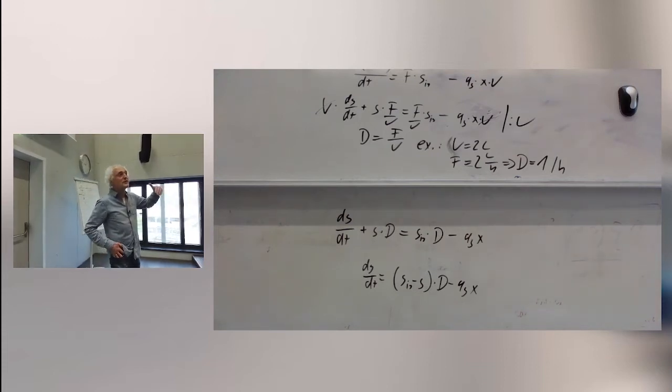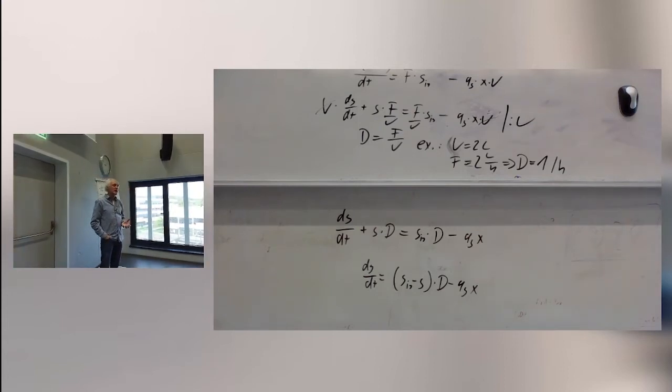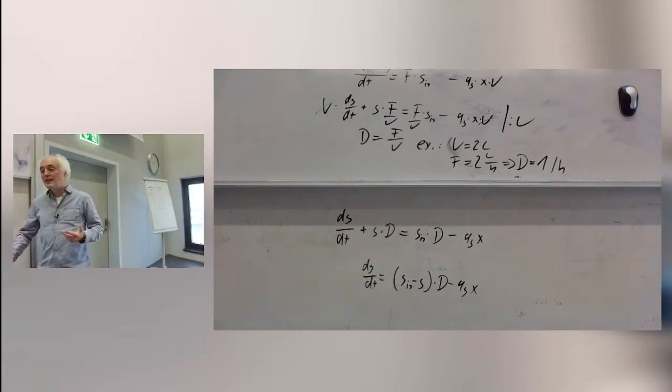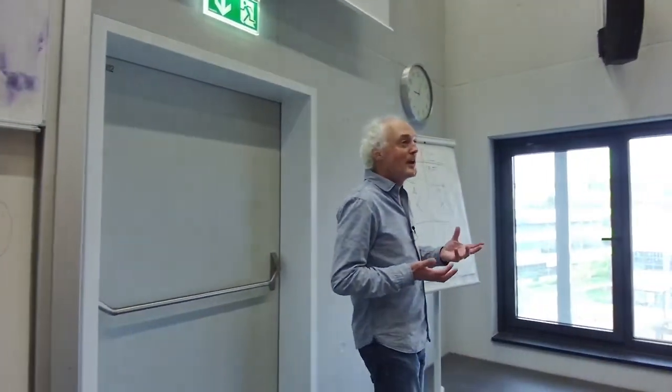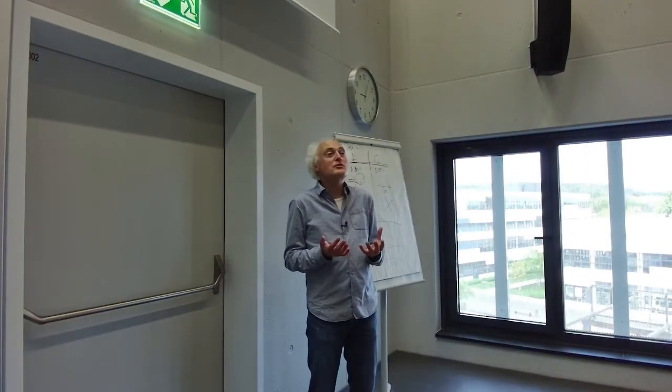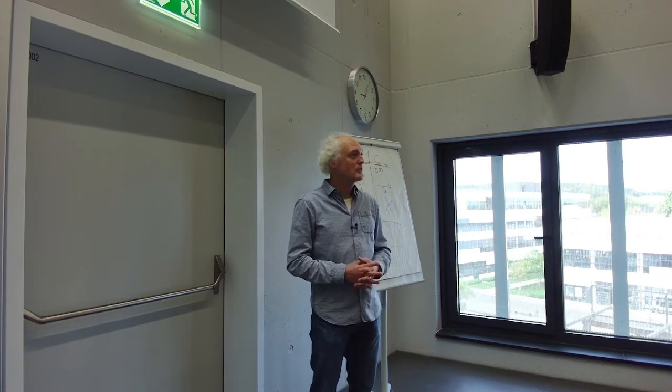This is something if you do your bioreactor, if you do your culture, and you have a biomass concentration, and you want at the end your microorganisms to consume a substrate concentration of 150 grams per liter. Could you start right away with that if you start with 150 grams per liter glucose? What do you think?